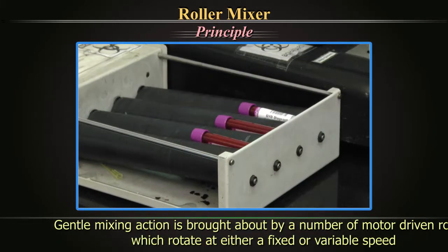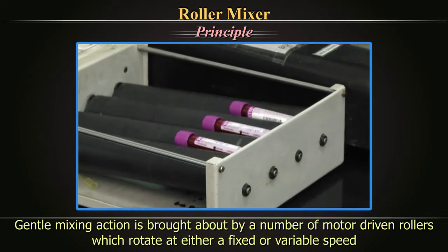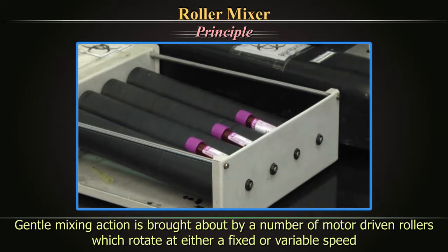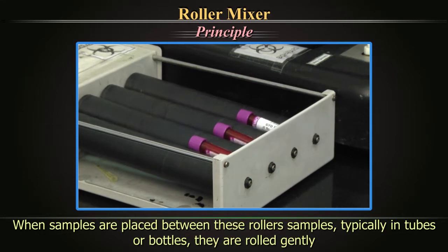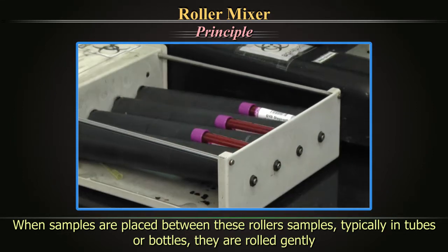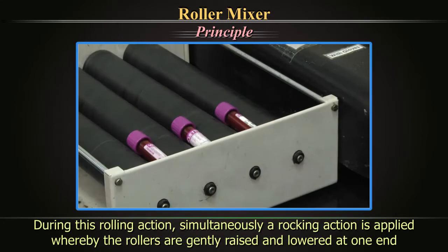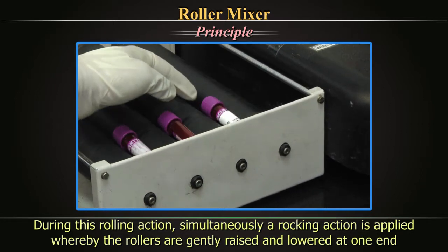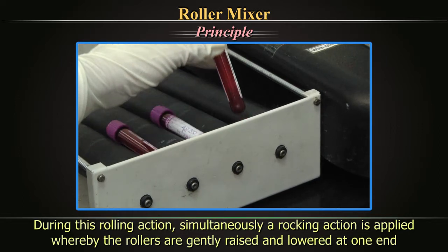Principle: The gentle mixing action is brought about by a number of motor-driven rollers, which rotate at either a fixed or a variable speed. When the samples are placed between these rollers, typically in tubes or bottles, they are rolled gently. During this rolling action, simultaneously a rocking action is applied, whereby the rollers are gently raised and lowered at one end.